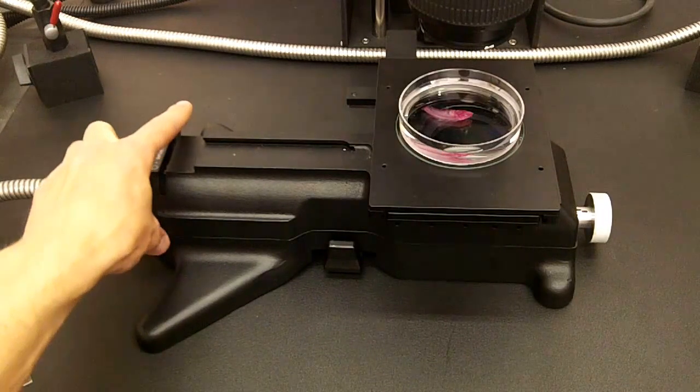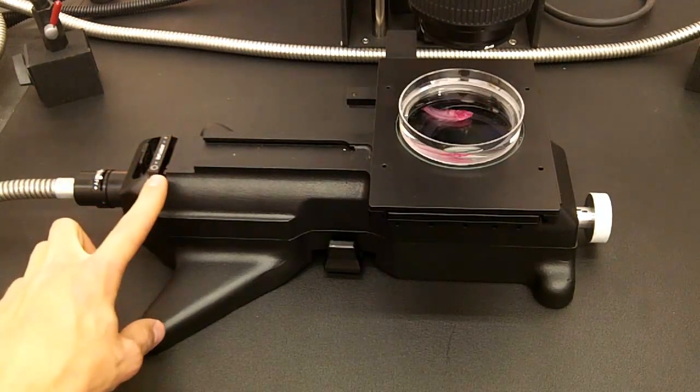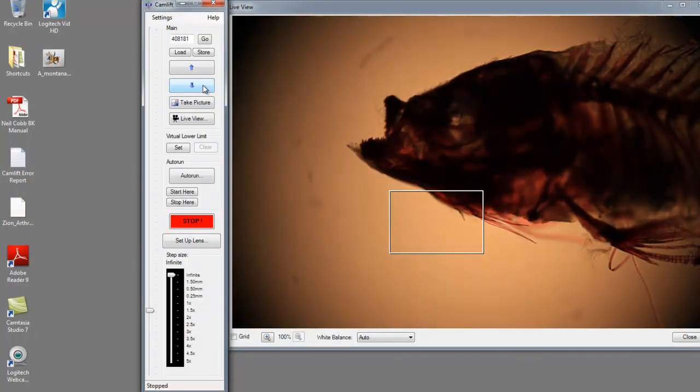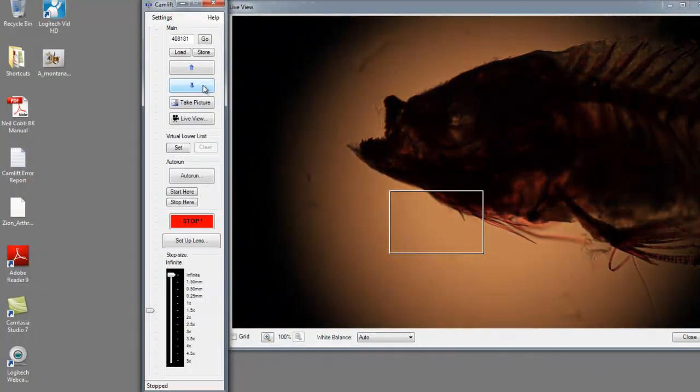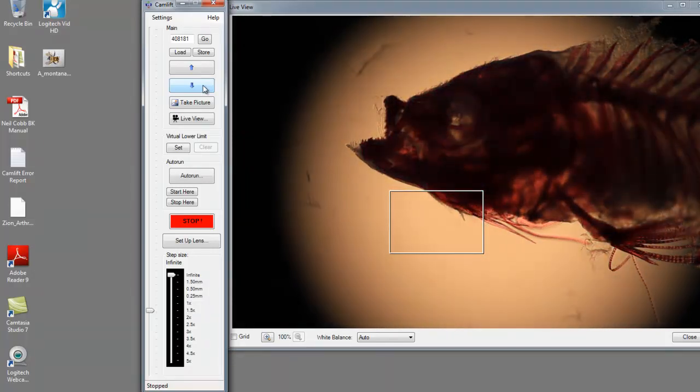This next lever is the aperture lever which adjusts the size of the aperture and the area being backlit. As you can see here, reducing the size of the aperture and then enlarging it again.